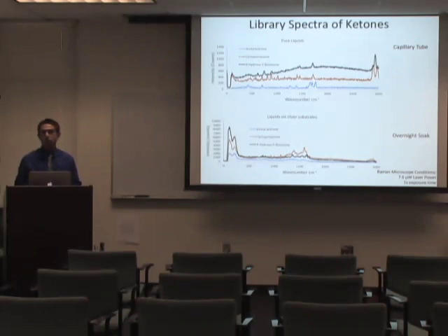They're just simple, small, skinny little tubes that I put in the liquid itself and put under the microscope with nothing added, just simple ketones themselves. And I did this just to collect a library, just to collect what I should expect when I collect the data. On the bottom, we actually see the data represented when I put them overnight in millimolar solutions.